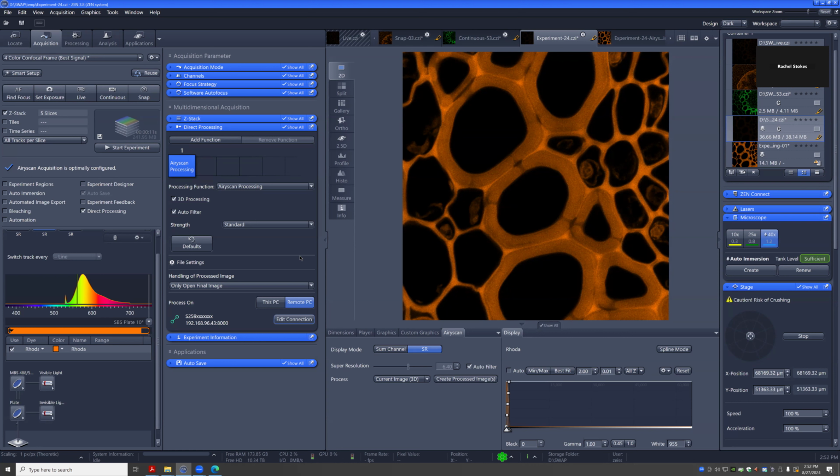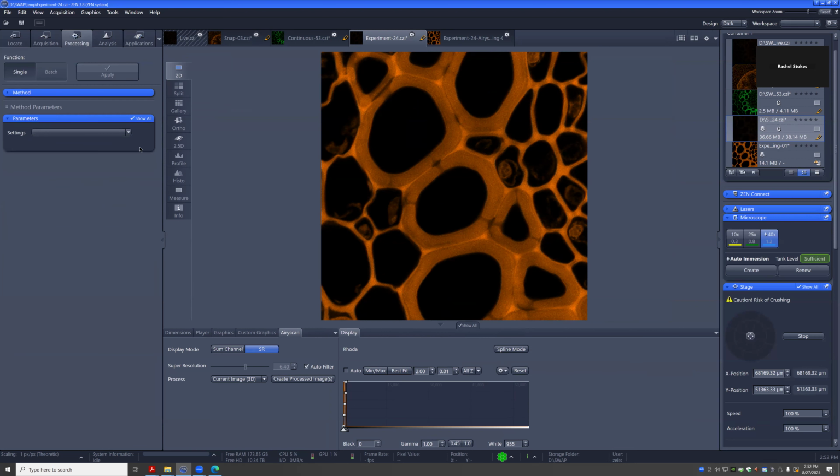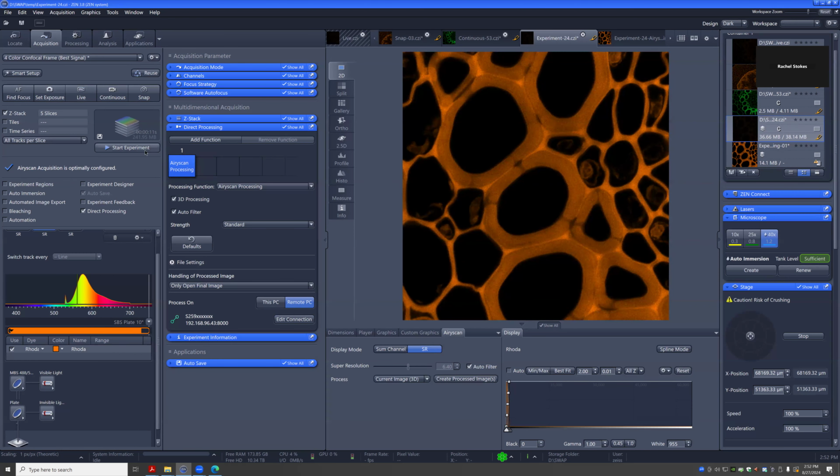This is what I did with the engineer. I literally had him sit next to the computer, because you'll see once it's working, when you hit start experiment, it streams the data. On the other side, you see a little bar under this menu, the same menu as here. You'll see current request, and it'll have a little loading bar that is doing something. That way, you know everything is working. But I don't recommend running between these two systems to see if it's going right. It'll spit out the data here once everything works as it should.